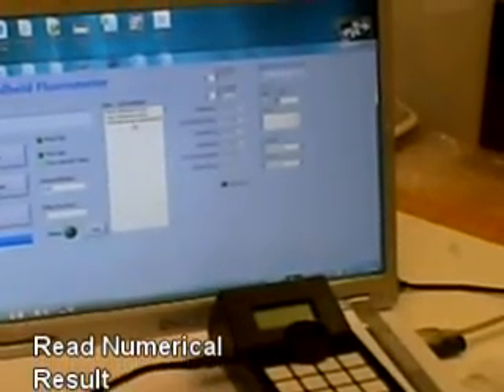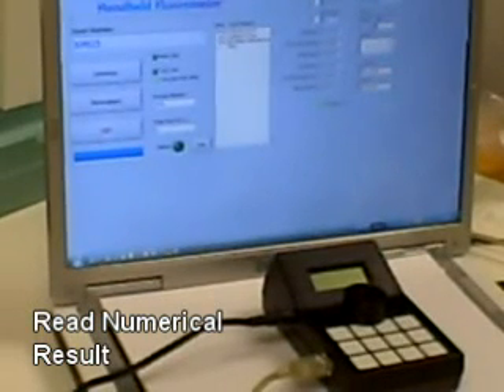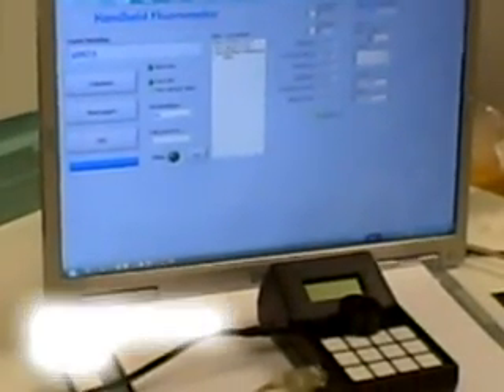As you can see, all three calibrations are recorded on the screen. The reading on the screen is a numerical value which depicts the fluorescence that was detected from the enzymes that were present from the bacteria. In this case, there was a very low level of bacteria present.